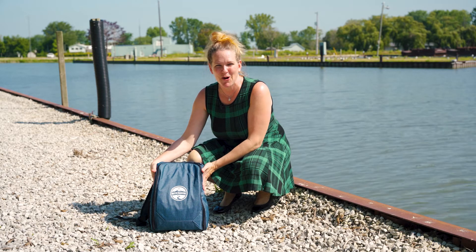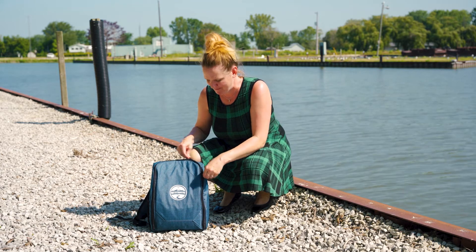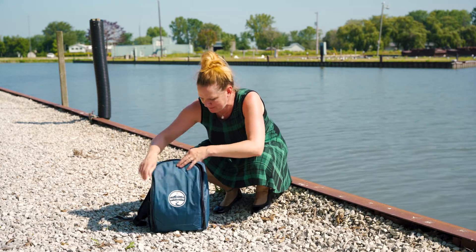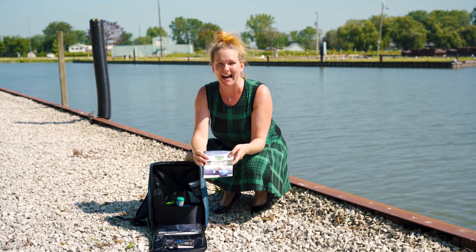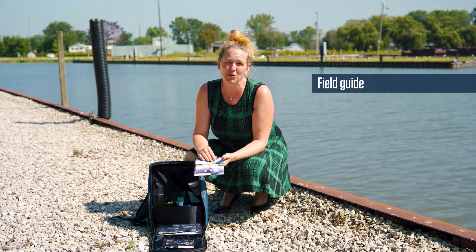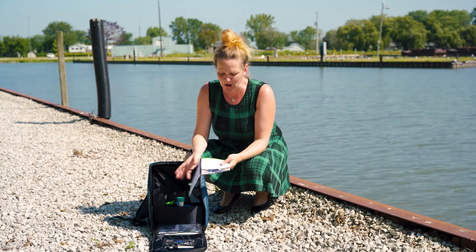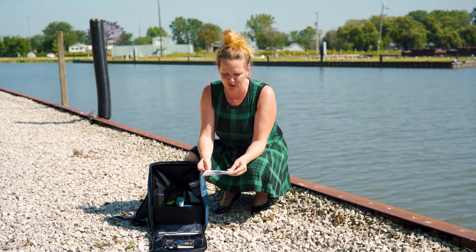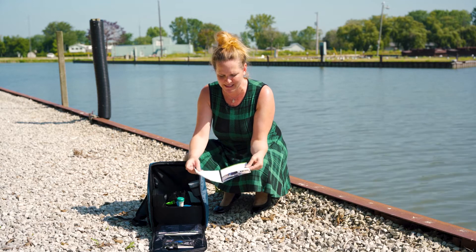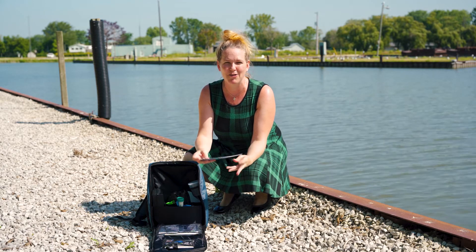This is our Freshwater Explorer test kit, and I'm going to show you how to use it today. When you open it up, the first thing you want to do is get out your field guide. It has everything I'm going to go through today and much more details that you'll want to review before you go out testing. We're going to be following the quick start guide on page 3, which has lots of photos and instructions on how to do your tests.